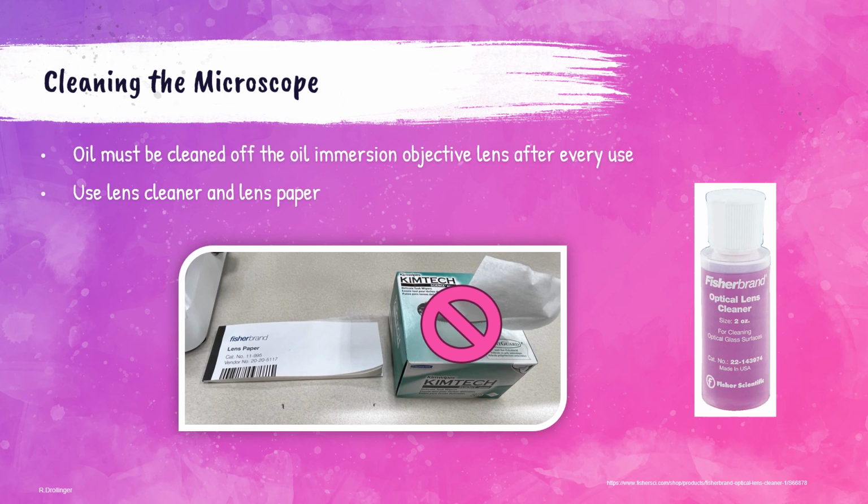After you've cleaned the lenses, the scope needs to be turned off. Depending on what laboratory you're in, it may need unplugged, and then of course the dust cover put back on the microscope. All right, so that concludes our lecture on microscopes.